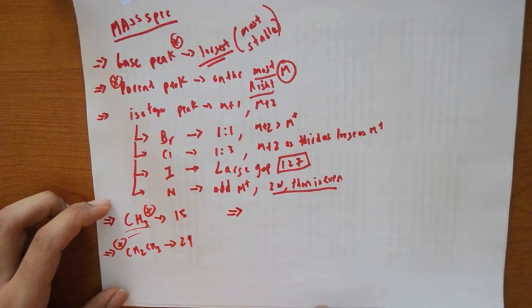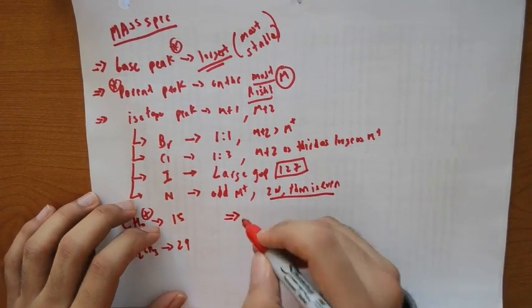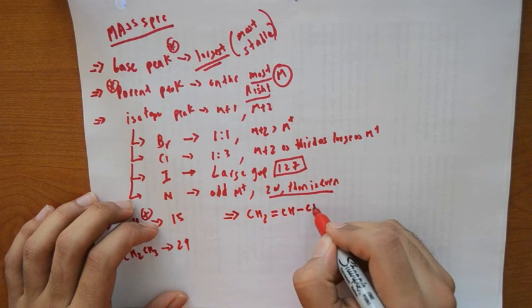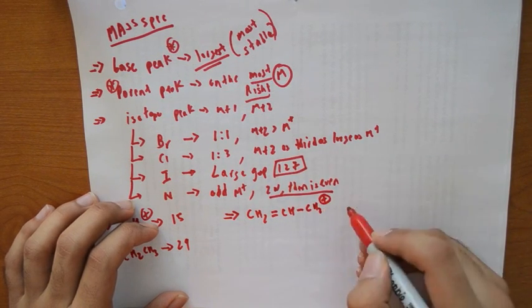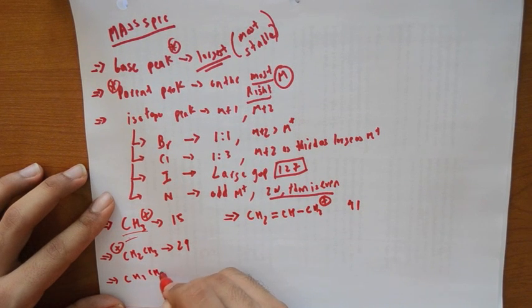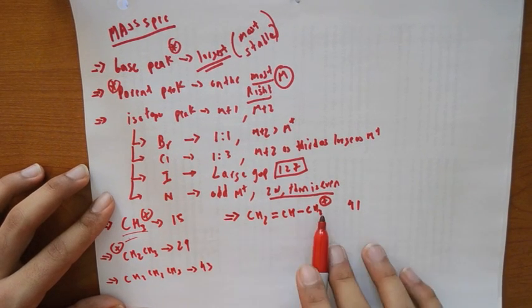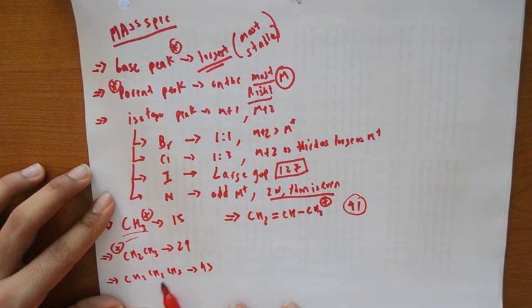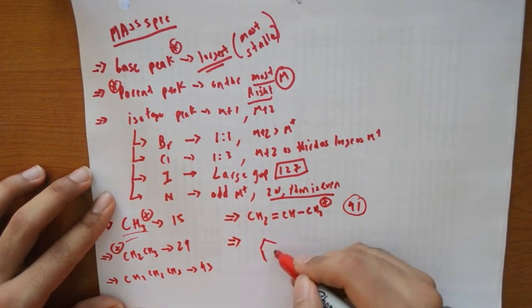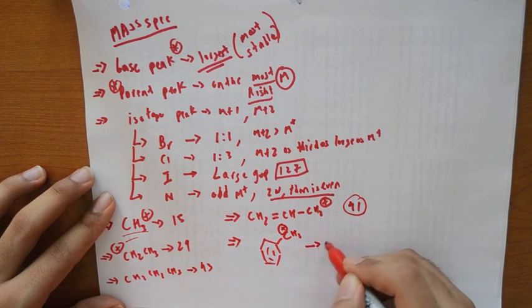An important one that the professor at my university, when I took the course, and my students when they're taking the course, she likes to test is something called an allylic. And allylics are at 41. Don't get confused, because people think, oh, CH2, CH2, and CH3, which is a propyl, which is 43, oh, it's close enough, we can add it. No. 41, it's not propyl, it's allylic. Okay? Another important one, which professors like to put on the test somehow, is benzylic, which is at 91.